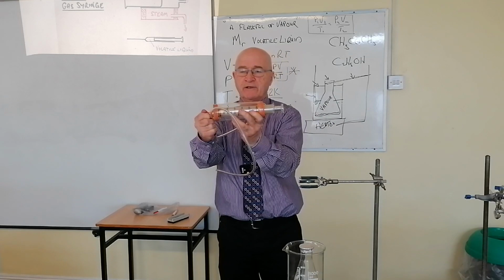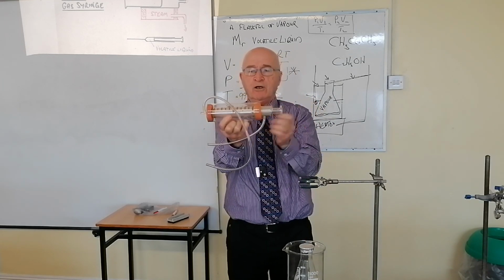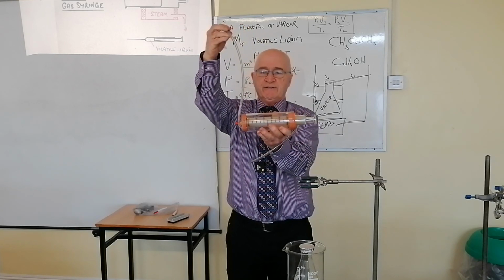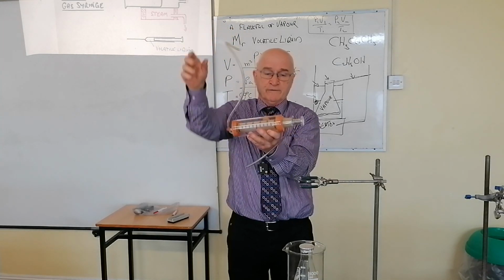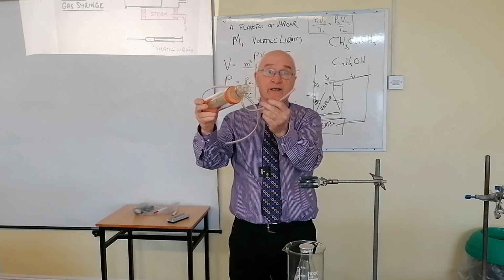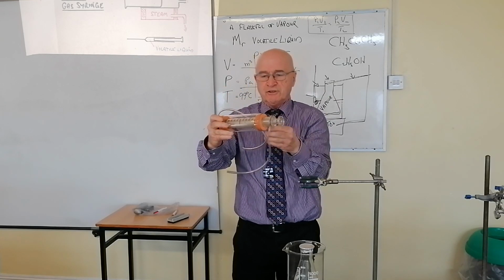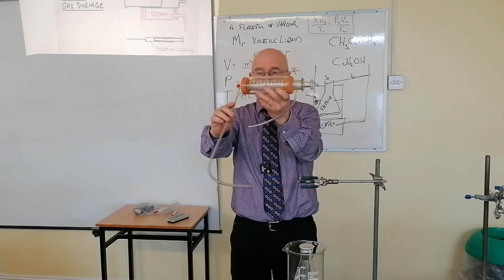This is the gas syringe. I had one in class the other day for you. Do you see that? But it's wrapped around, I'm holding it on the outside, by a steam jacket. And what's that? It's a glorified container around it. You put the steam in one end and it goes out the other end. Now suppose you connected that to a steam generator. That would be a glorified boiling kettle with this connected to the spout. And the steam would go in here, it would fill the outer chamber, and the steam would come back out through this one. And that's what you'd have.